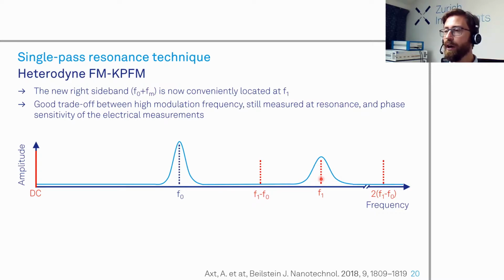So now we are a little bit back to this example with the amplitude modulation, but we do it in a phase sensitive manner because this excitation is actually phase linked. I mean, it is coherent with the carrier here, because of this excitation relationship here. And so in this case, we are sensitive to the phase.